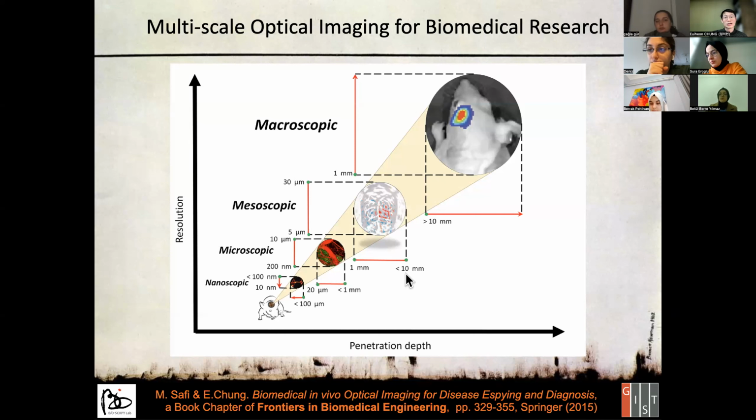But the real entity you are interested in, in neurophotonics, is the neuron, a nerve cell, and neurons communicate with each other via so-called synapses. Those synapses or dendritic spines are tiny, sometimes micron or less than micron, or nanometer scale. So there has been a revolution in the microscopy field to look at the level of nanoscopy, let's say tens of nanometer scale.